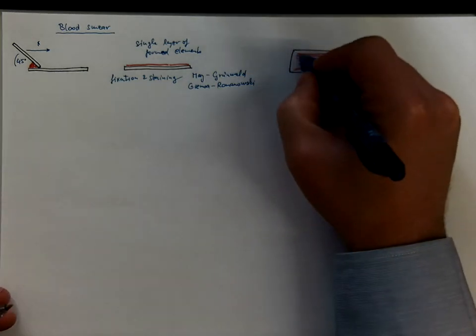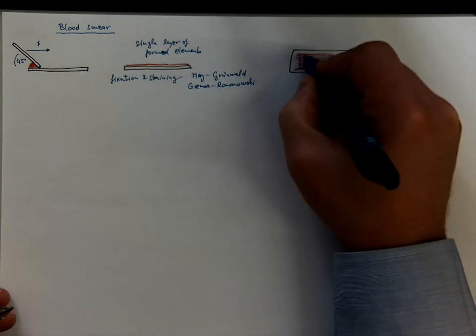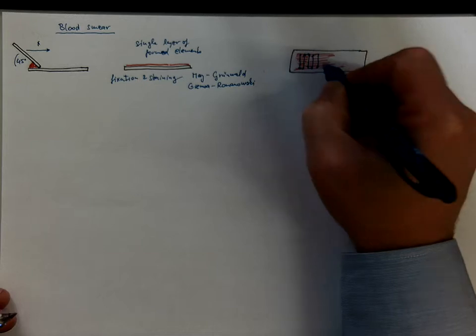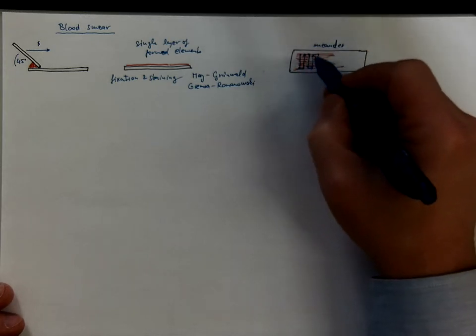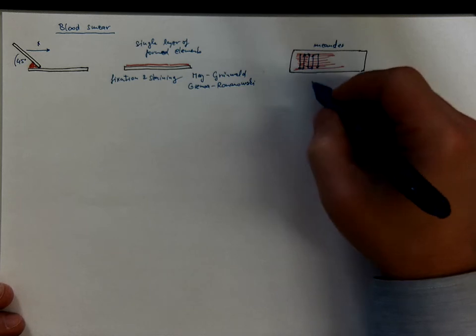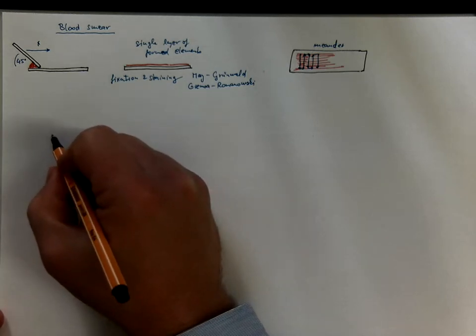You will find your starting position, move to the edge, then move 1 width of your field of view and go back and simply systematically meander your slide to be sure you will never come to the same position twice. And you will need oil immersion objectives for that purpose.